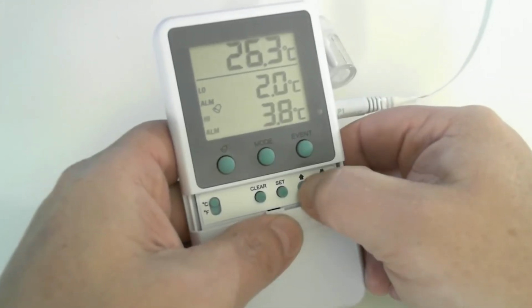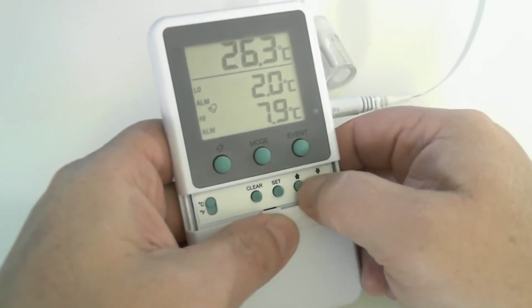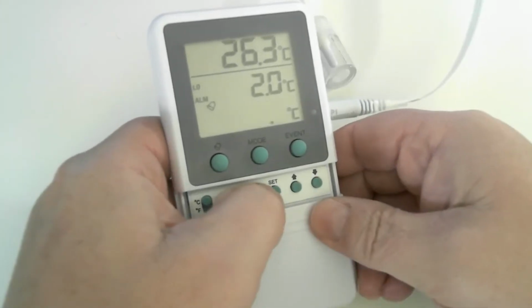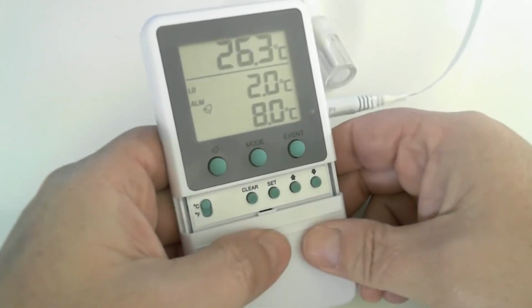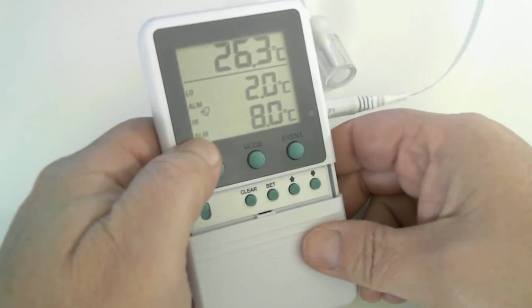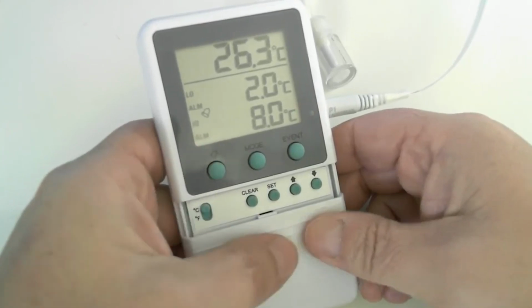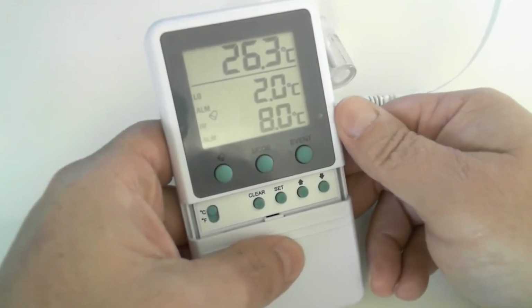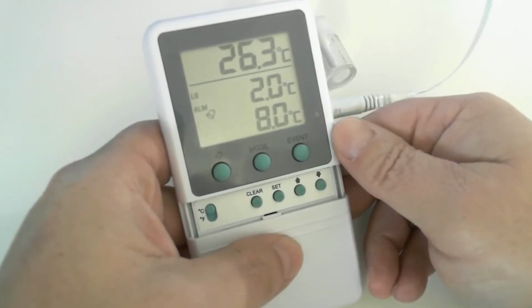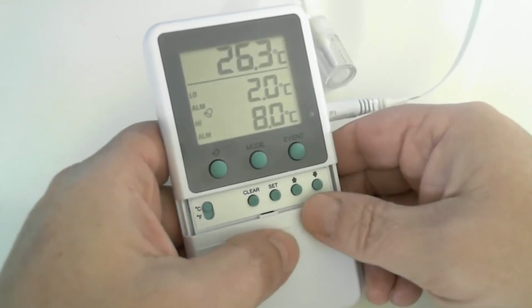Went a little too far there. Let's go back up. As I said, once I hit that set, we will go into an alarm condition. That's okay. Alright. The LCD screen is showing you a flashing high alarm, meaning that you had an excursion with your high alarm set point. You have a red LED blinking, and you also have the audible alarm. Beeps about 10 times, goes silent for a bit, beeps 10 more times, and will continue until you hit any button, which will silence it.